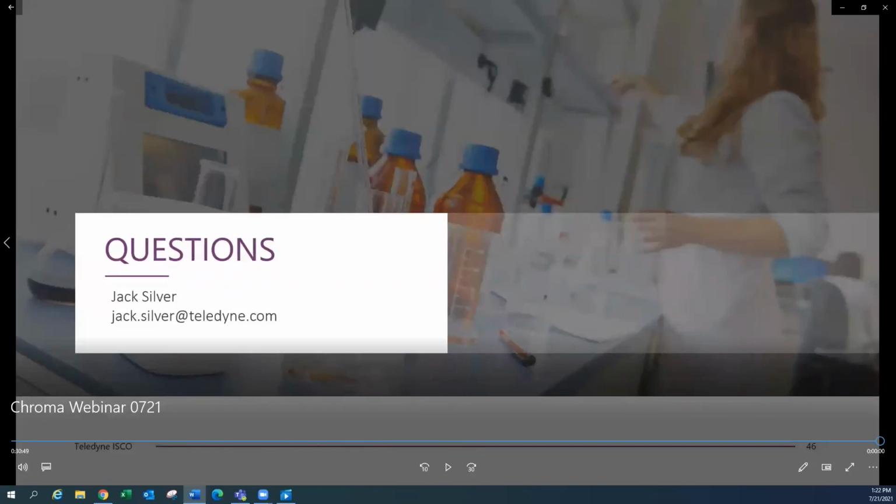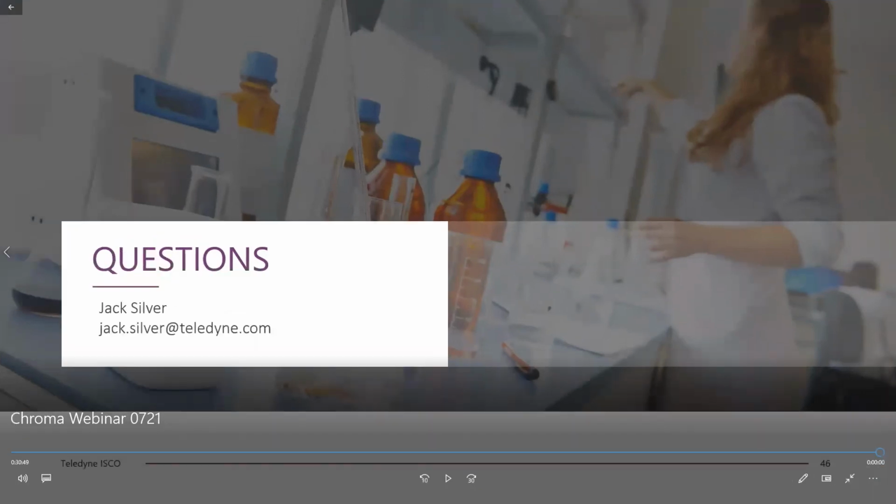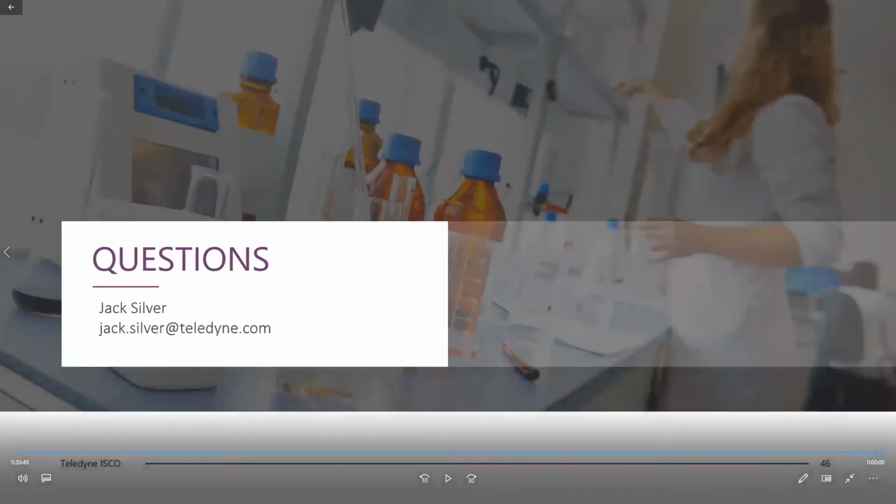The next question is, when you use a scouting method, are you worried about sample loss? The answer is not really, because my scouting methods are either run on an analytical HPLC, which uses only microliters and micrograms of sample, or if I need to run it on the ACCQPrep, I only need maybe 1 or 2 milligrams for the scouting gradient. So I don't have very much sample loss. And if you use the ACCQPrep, you could still collect the fractions and then recycle that material. So that's a good question.